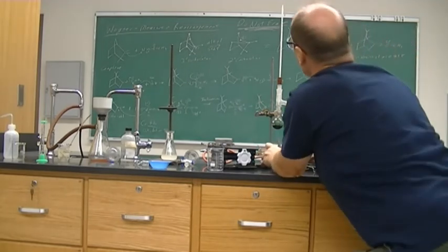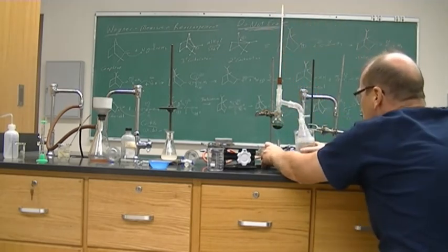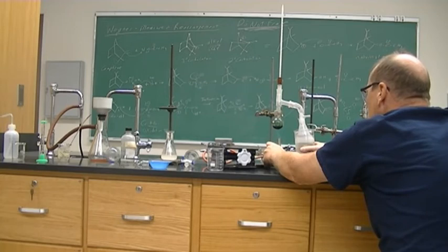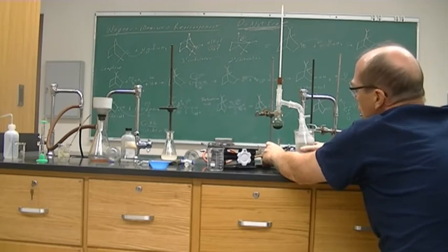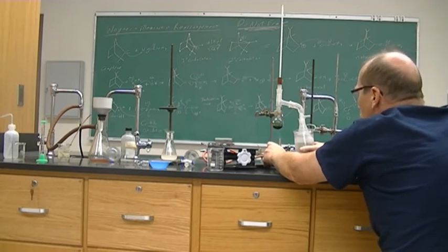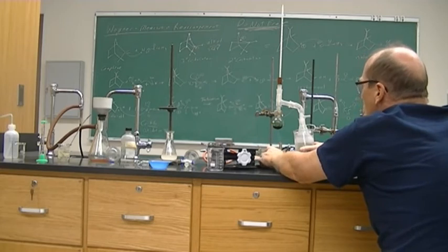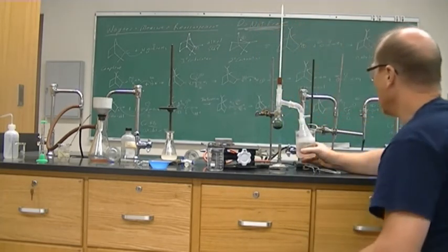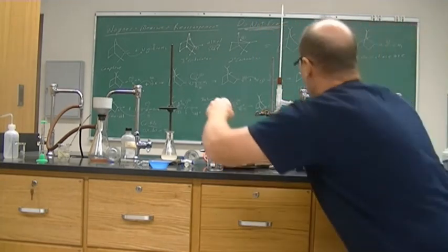Long distillation. All right. We're still at 104. All right, seems to be about done, and again, we're still at 104. Boiling has slowed down. We're going to go ahead and end it.